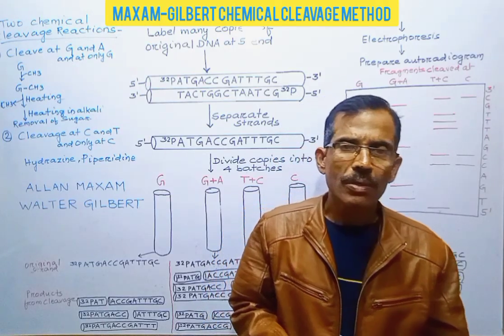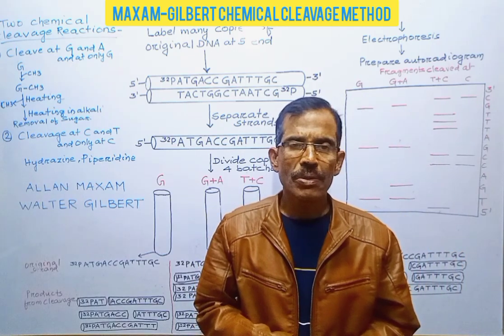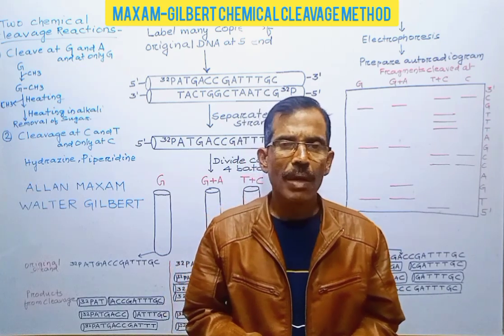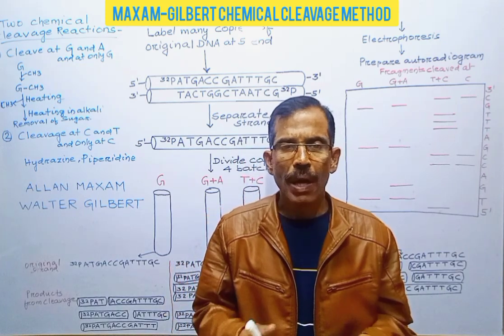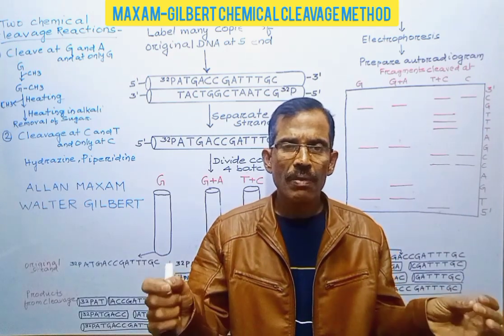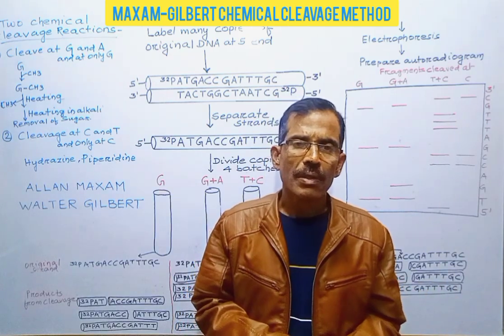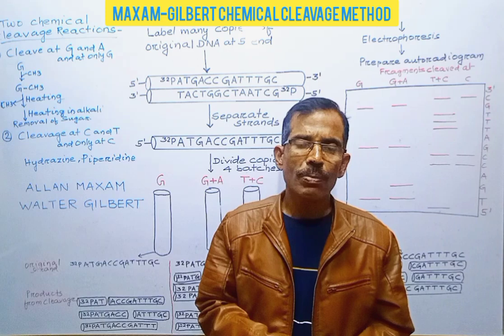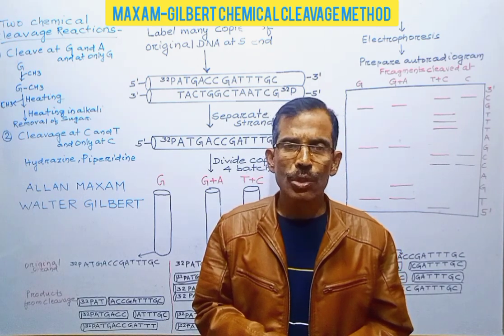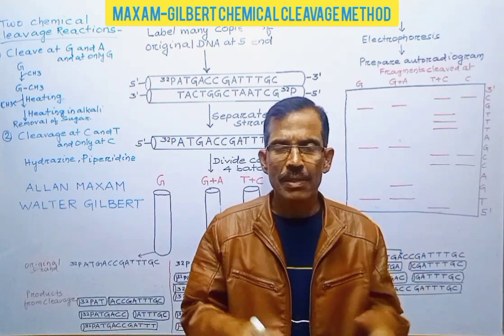Friends, in order to understand the structure, function and the evolutionary history of the human genome, we should know its primary structure. The primary structure of the human genome is the linear order of 3 billion nucleotide base pairs that constitute chromosomes of the human genome. The primary structure of a genome can be determined by DNA sequencing methods.